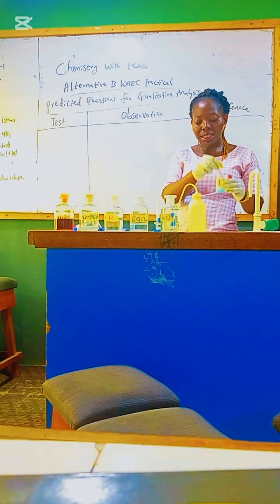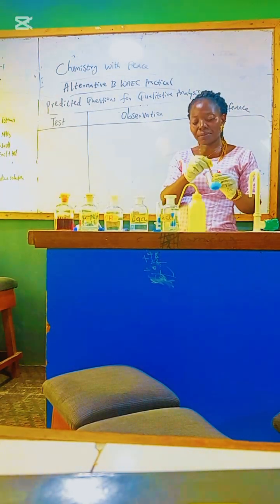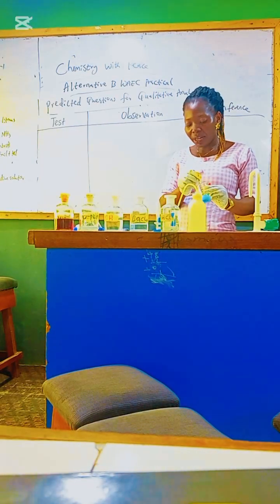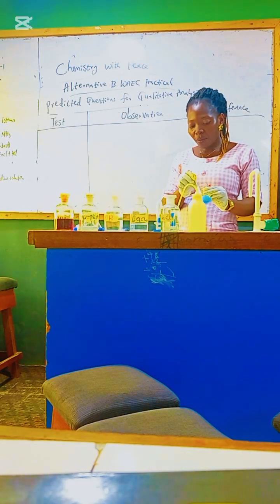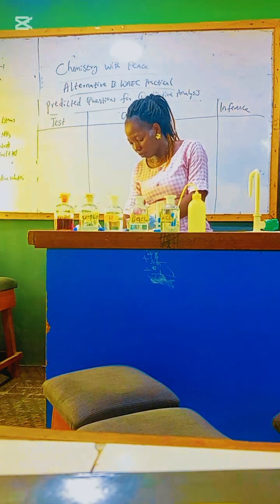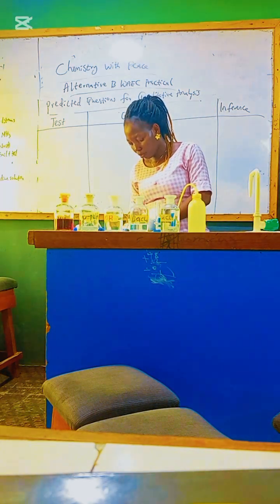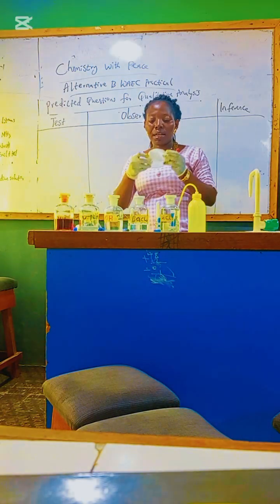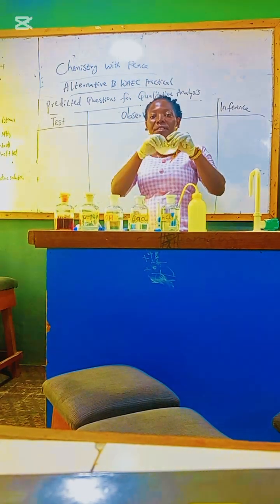I will stir it very well. Then my filter paper.